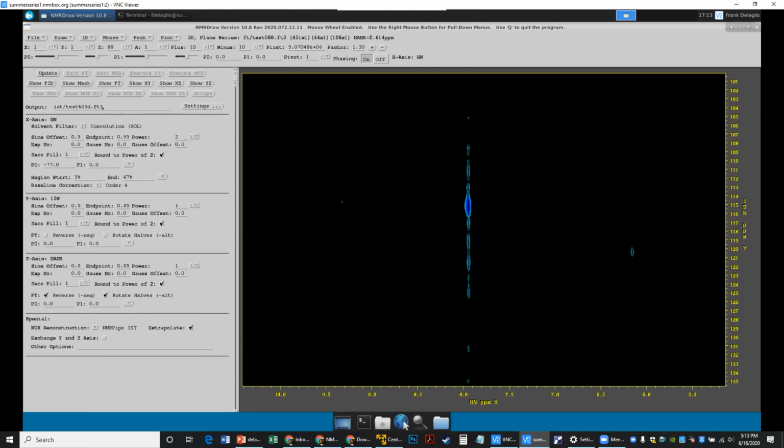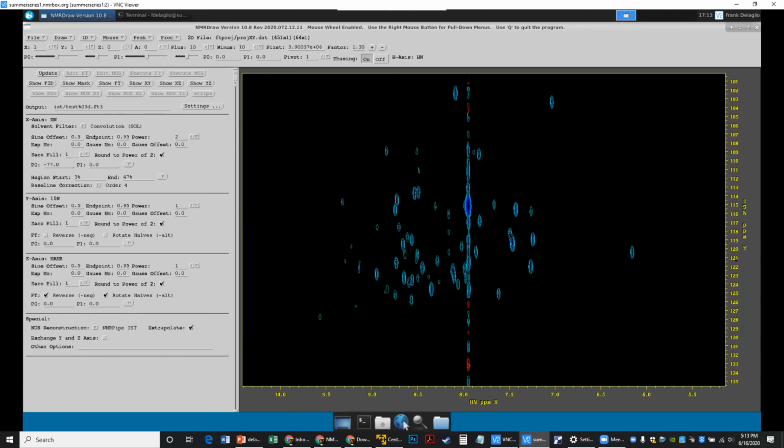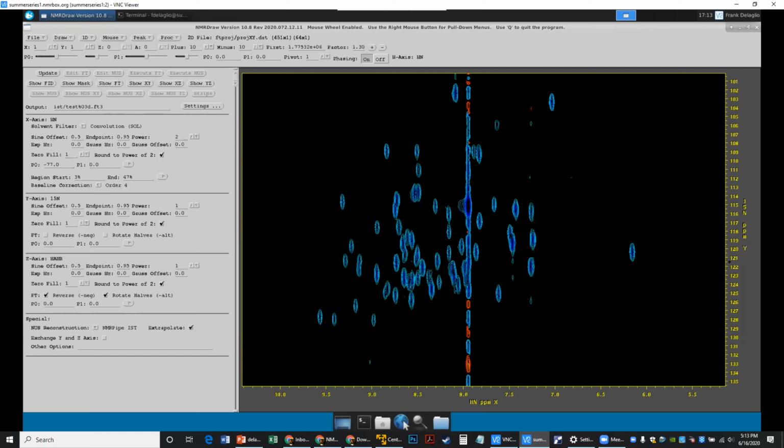Hey, Frank, Jeff here. This is a non sequitur, but have you ever tried Sierra for solvent suppression? That won't work. Thank you. It's a doubly selective suppression technique that needs a proton and a carbon. It's an HX tool. Well, I was thinking more of the processing, the fitting side. Oh, I suppose you could use a SMILE signal model as a way to subtract solvent signals. Yeah, that is within the realm of the possible. Haven't tried it. It's a good idea. I'll keep it in mind.